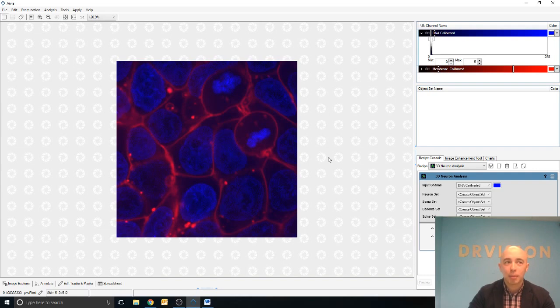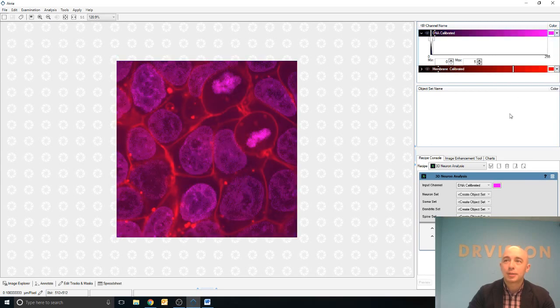It is still worth keeping in mind that the colors we have displayed here are artificially applied by the lookup table that we have selected. They don't necessarily represent the reality of the fluorescent label used. We can change this again. If perhaps we don't like blue, we want to go to this pinkish color here, or bright green. Now, while there are multiple color channels in this image, they are in the same space and taken at the same time frame. But we can extend this to have a time dimension in image visualization as well.